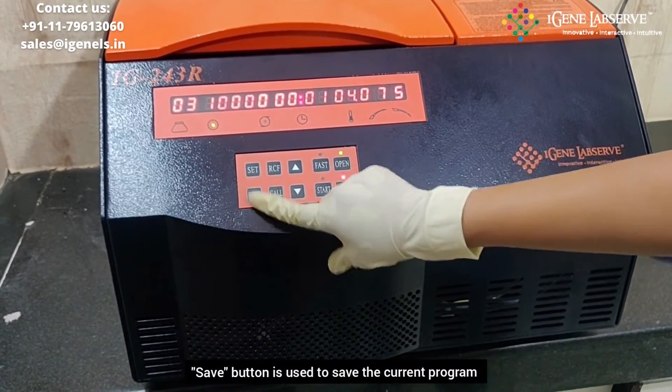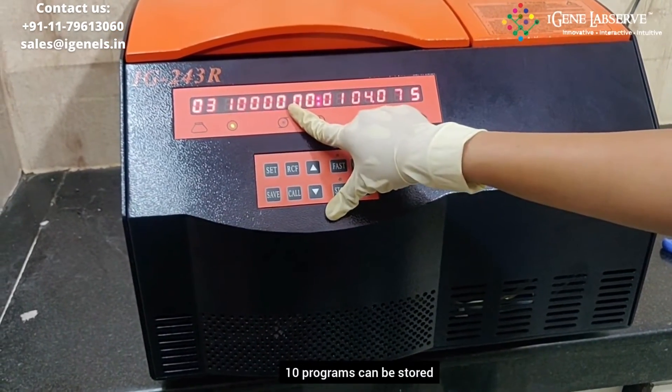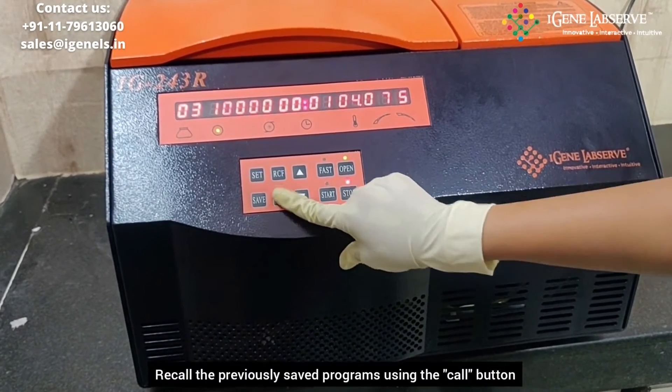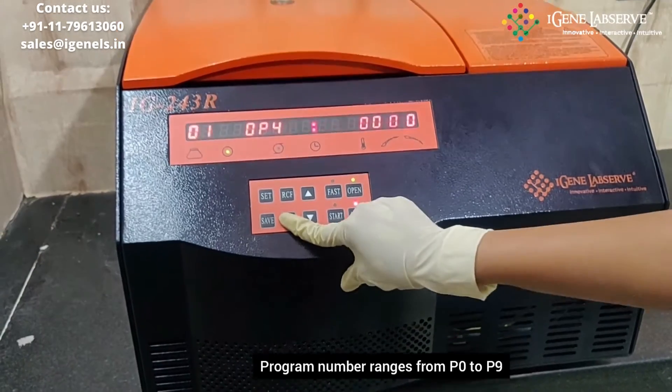This button is for saving the current program. It can store a maximum of 10 programs. To recall the previously saved programs, you have to use the call button. It has programs ranging from P0 to P9.